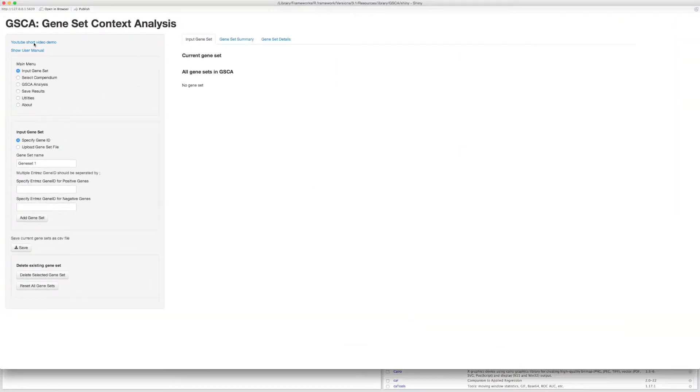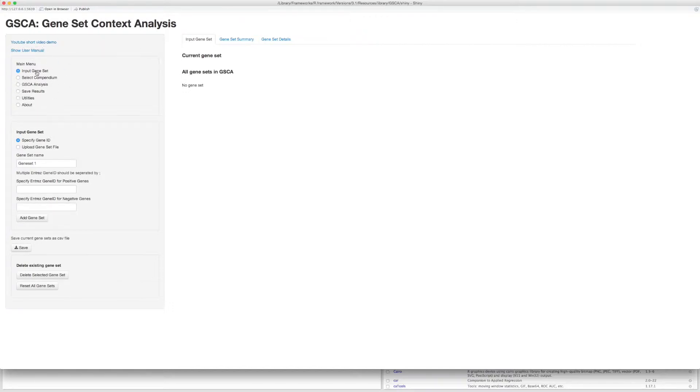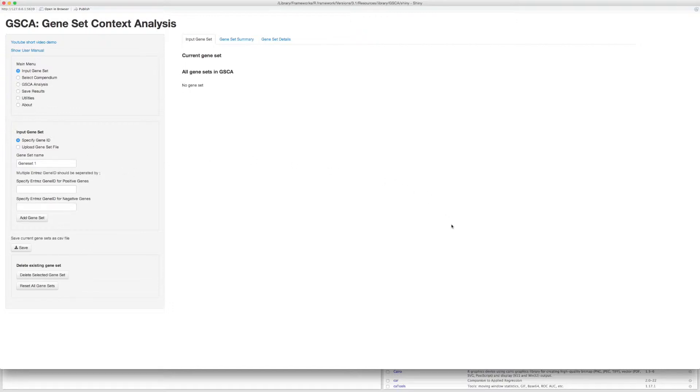The user interface will pop up in your browser window. The main menu is on the top left side of the page. You can switch to other steps of the analysis anytime. On the left side is the sidebar panel where options appear. In the middle is the main panel where almost all outputs will show up. I will walk you through the basic analysis procedures using two examples.